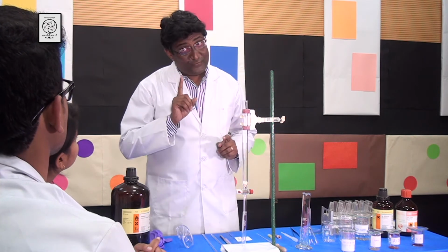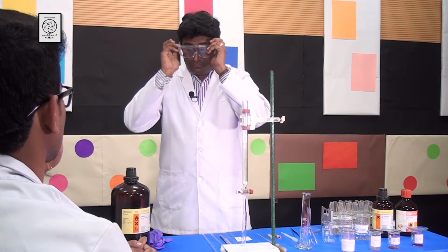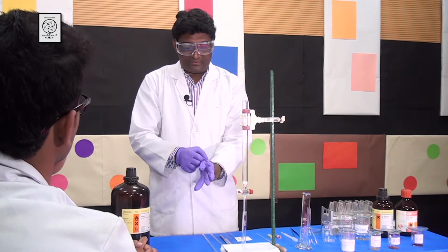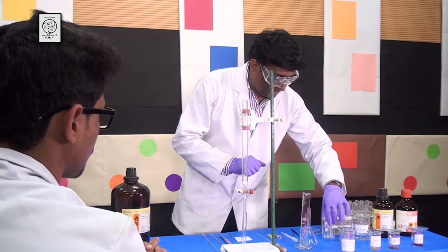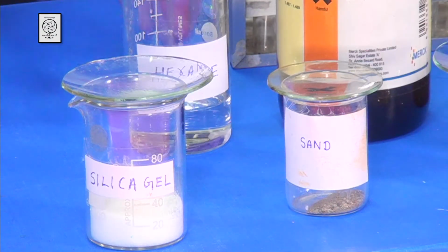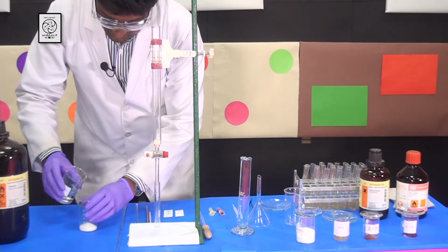Now I will tell you how to make the slurry of silica gel. Okay, sir. But before doing that, I need to wear the safety goggles and safety gloves so that the silica gel that I am going to take doesn't fall into my eyes or onto my hands. Okay? All right. So I am going to take a beaker and some of the silica gel that I already showed you. Then I am going to take some hexanes, which I have here, and pour it in.